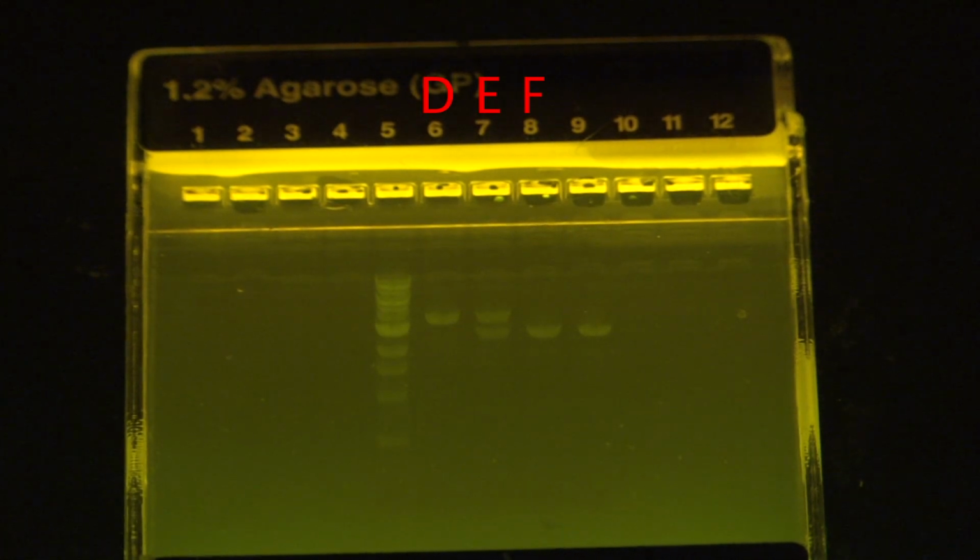When you looked at the DNA from the crime scene, there was 1 band that was lower, and it was the same length as person F. Thus, suspect F's DNA matched the DNA found at the crime scene. That's how DNA fingerprinting analysis can be used in forensics.